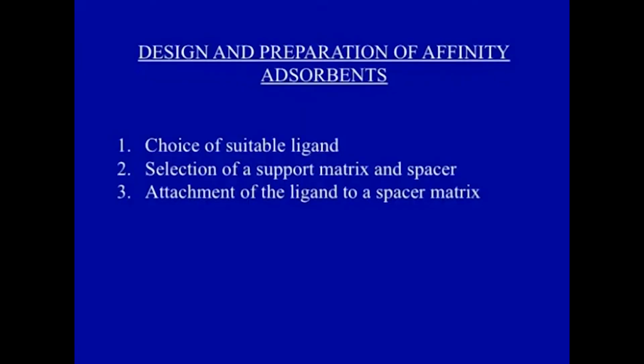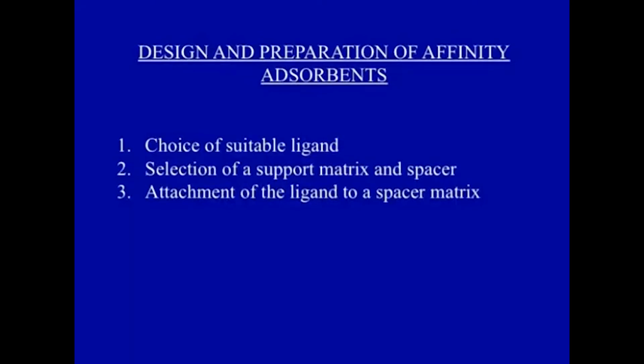So, if you consider the design and preparation of an affinity chromatography matrix, like I said, it requires choosing certain particular things in the affinity adsorbent for purification of a particular protein. It involves three major factors: one is the choice of a suitable ligand, second is the selection of a support matrix and spacer, and then the attachment of the ligand to the spacer matrix. So, let us discuss each of these things here in detail.